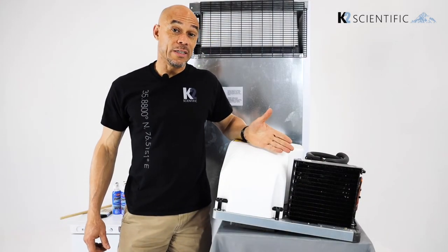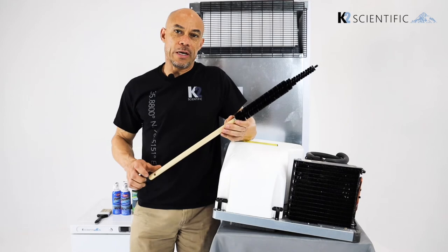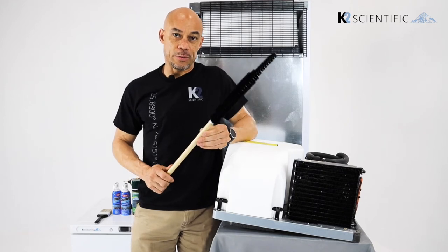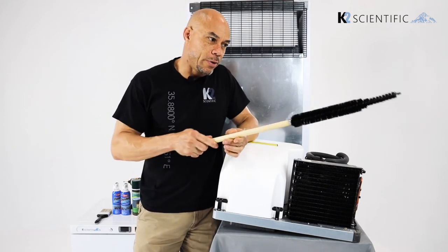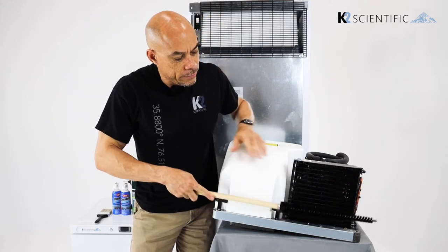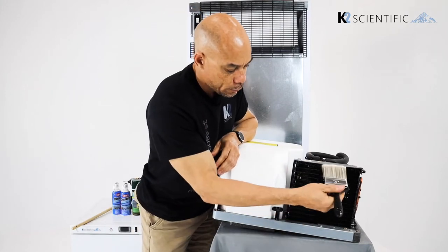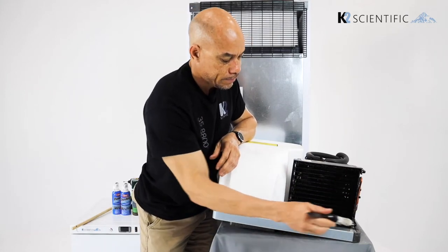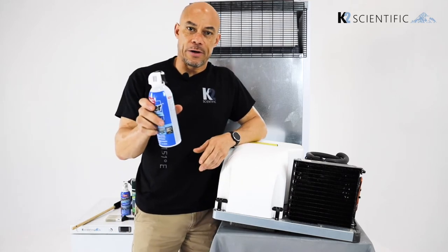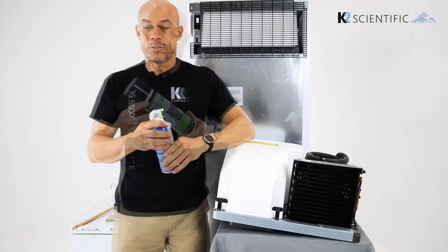The tools that you use to clean a condenser are really simple. A condenser brush — it's got a nice long handle because sometimes condensers can be hard to reach, and you might have to reach past other components to simply brush the dust off of these fins. You can use a soft paint brush to remove dust and dirt. You can also use compressed air to blow and remove some of the dust in between the fins.